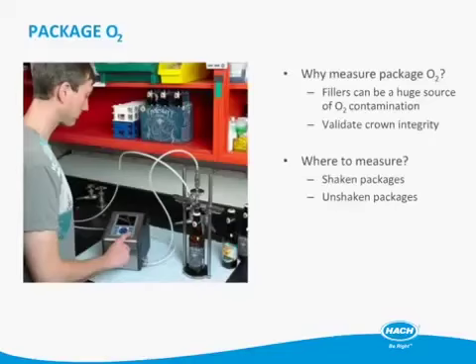And these two values, if you take your unshaken dissolved oxygen minus what's at the base of the filler, you will get your filler pickup value. You can shake the packages too, and you can incorporate the headspace gas by shaking, and that really gives you the ability to calculate TPO from a dissolved measurement.